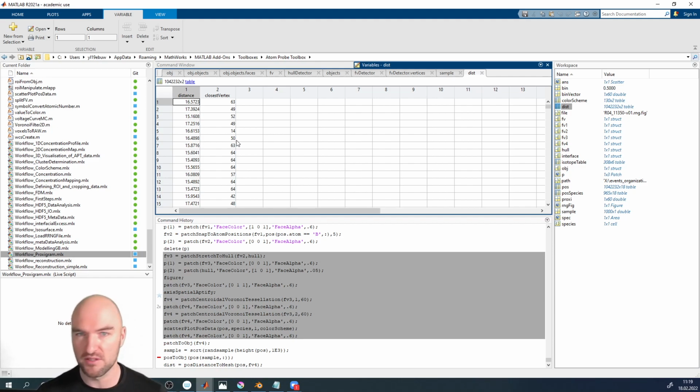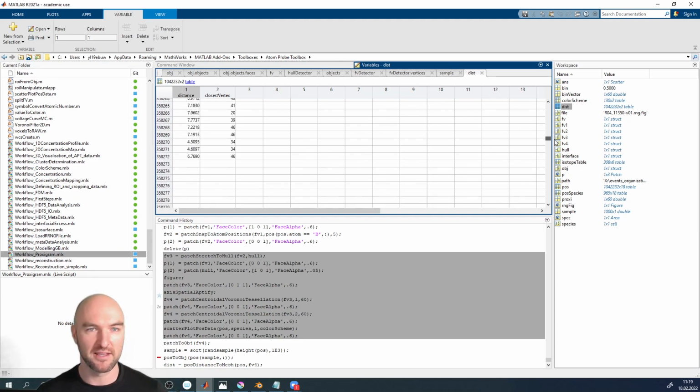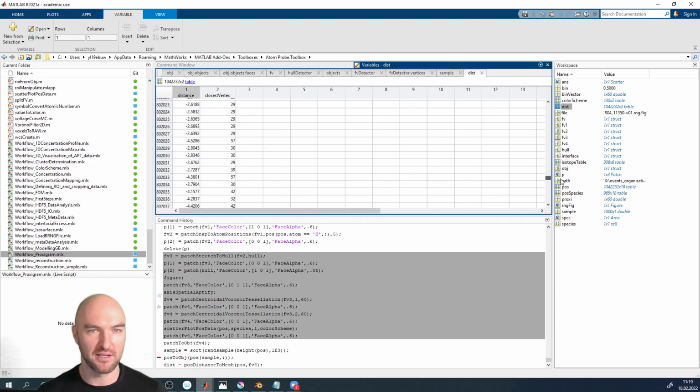And we're going to make use of that later. But for now, we're only going to care about the distance itself. In this case, it's a very simple data set. Everything is happening in the z direction. So you can see everything gets closer to the grain boundary, and then eventually it becomes negative and goes to the other side of the grain boundary.